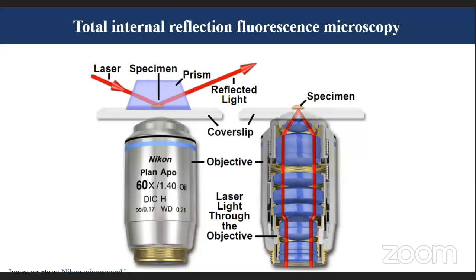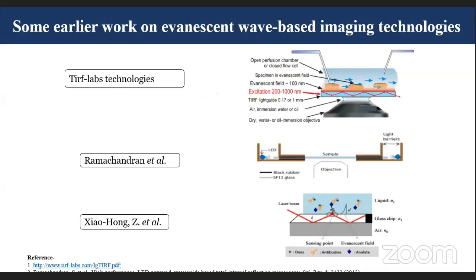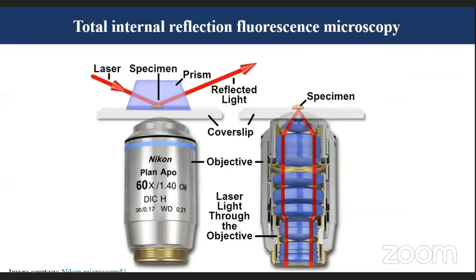They said that you can achieve this microscopy by two methods. They use a prism, a dove prism, where between the glass slide and the dove prism, in the first figure on the left hand side, you can see that the specimen is sandwiched. The light is incident from the side, and it gets totally reflected on the other side, and it illuminates the object over here, which was observed from beneath by the 60x objective.